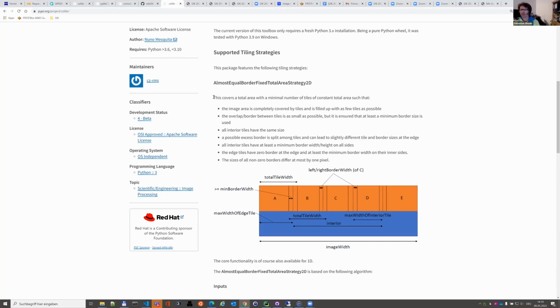So basically, the idea is that you have an array. For instance, let's say you want to train a deep neural network, and then you always have to decide how much overlap there should be between tiles. Is 5 pixels okay? Does it have to be 10 pixels, 100, 200, 500? There is no one value that works.